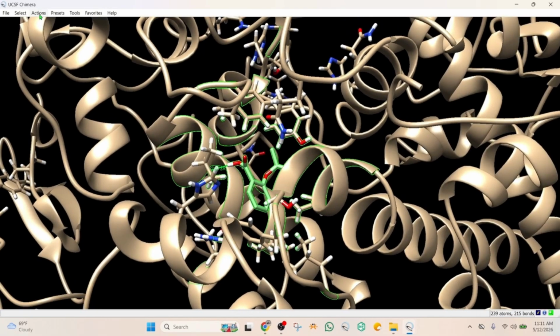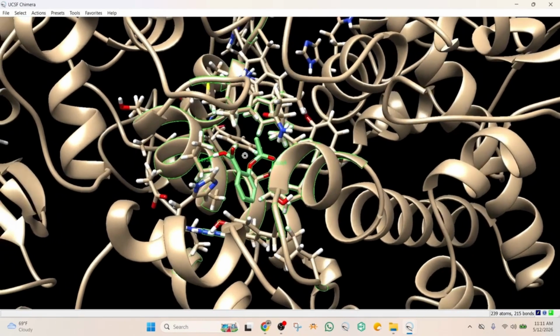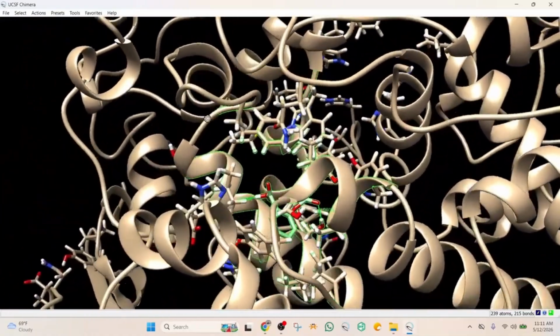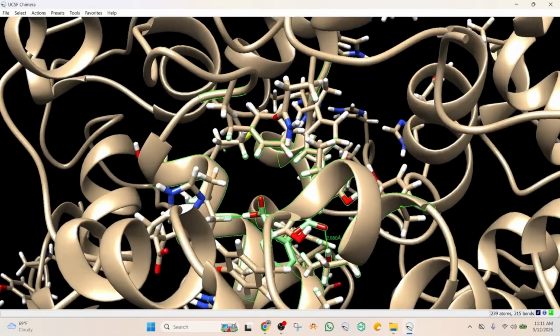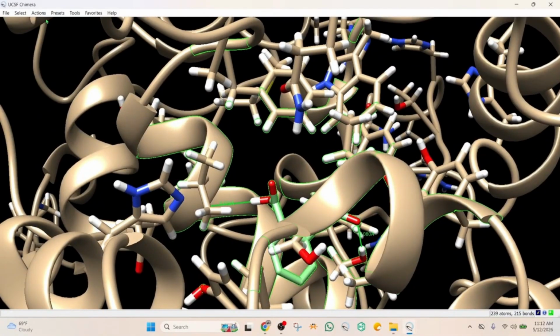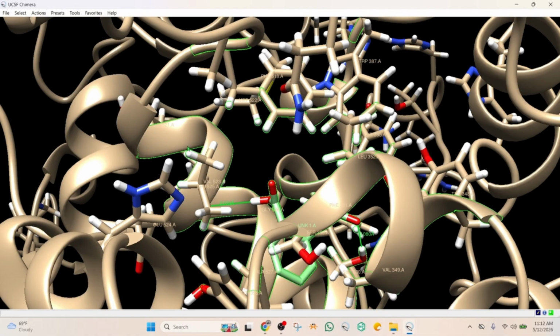Now let's export some side chain molecules as well, the side chain bases. These are the side chain molecules. It has 2 hydrogen bonds. Later on we will label it, don't worry. Let's label the molecule as well. Label it with residues, name and specifier.